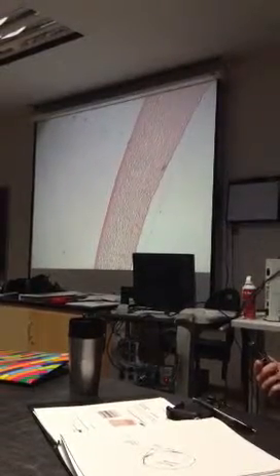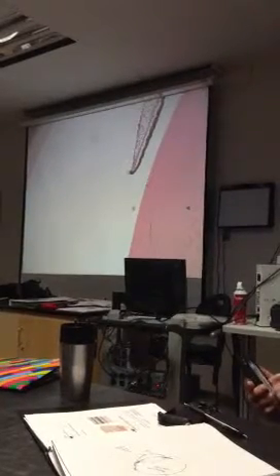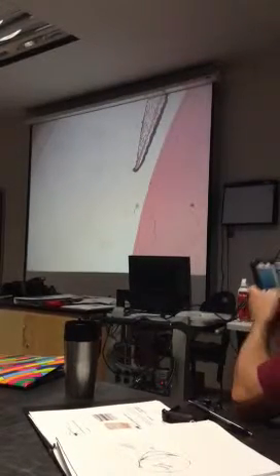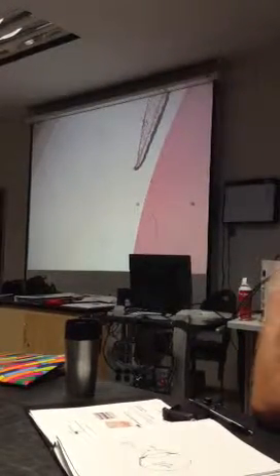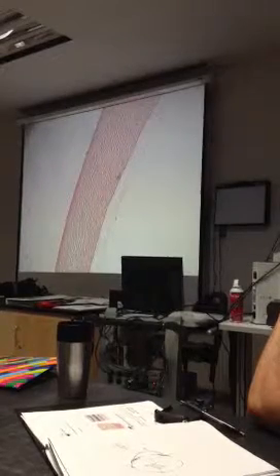This is the scanning lens, so this is as far away as I can get. This is the F23R, which should be the mid-sagittal section of the eye — that's the eye of the organ and you take a mid-sagittal section. You can see the pupil right there. We should be able to hit all of the structures just on this one slide. You had a couple other options, and those were fine, but this one just has everything.